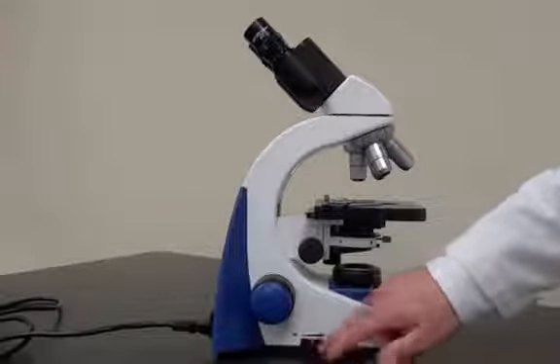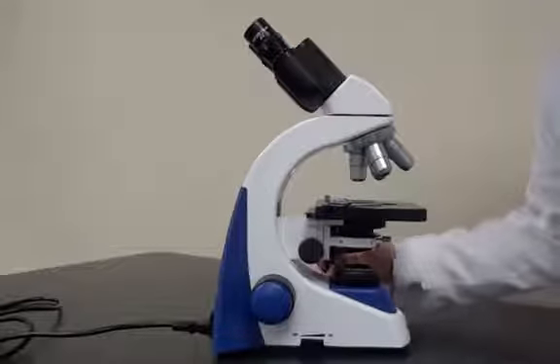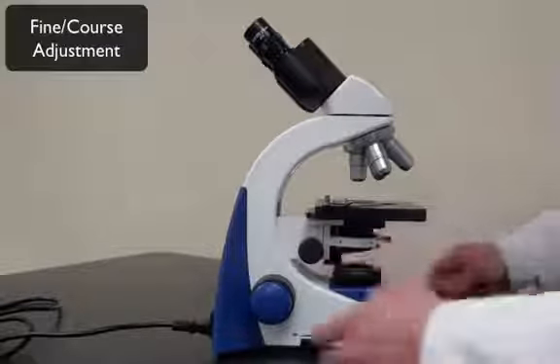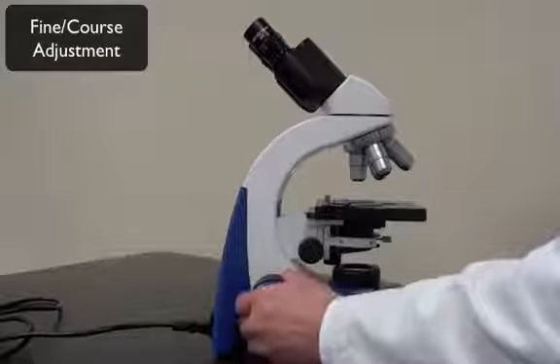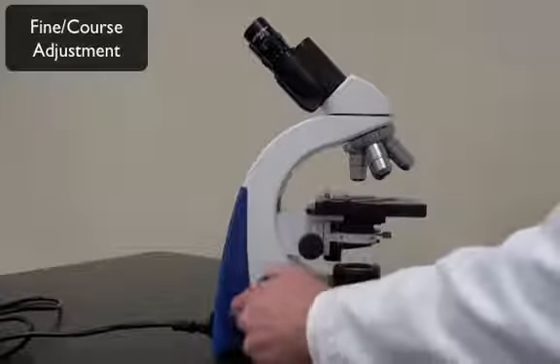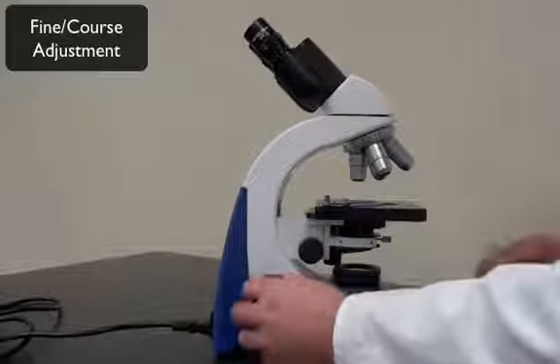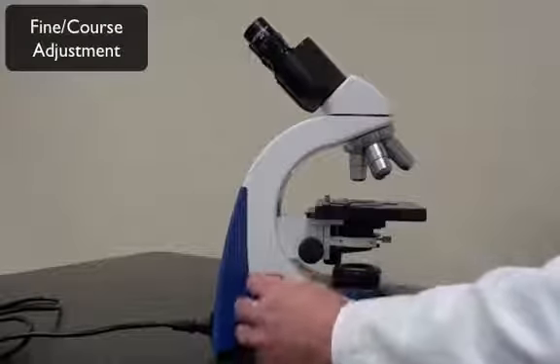The last thing we have, so we have the stage adjustment here, which moves the stage up and down, left and right, pretty much for the microscope. We have our fine and coarse adjustment. The coarse adjustment moves the stage drastically. You can see here up and down. The fine-tune adjustment here just does minor changes up and down.